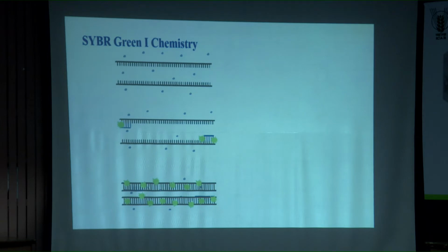So it is getting depleted again. So every passing cycle, new double-stranded DNA is formed that is going to be intercalated with the SYBR Green molecules, which are freely available, because in the PCR mix we added SYBR Green at a specific concentration and it is standardized. Is it clear? So every passing cycle, the freely available SYBR Green is getting depleted. And where is it getting depleted? It is getting intercalated in the newly formed daughter DNA strands, right?